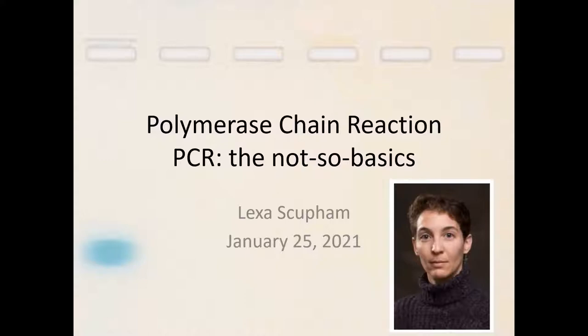I've been doing real-time PCR and PCR for about 30 years, and the purpose of this lecture series is to download as much of the information that I've accumulated as possible. This is a four-seminar series. The second one is about how to design primers and probes. The third seminar is about real-time PCR, and the fourth seminar is about troubleshooting PCRs. So I hope that you can attend those seminars as well.